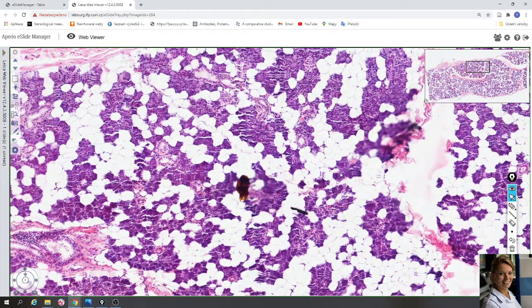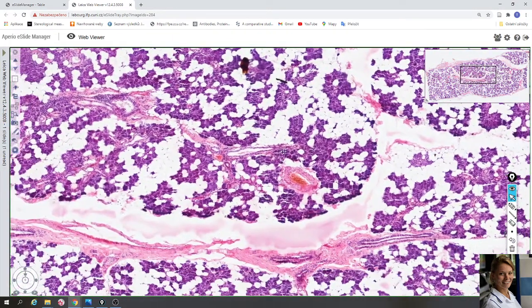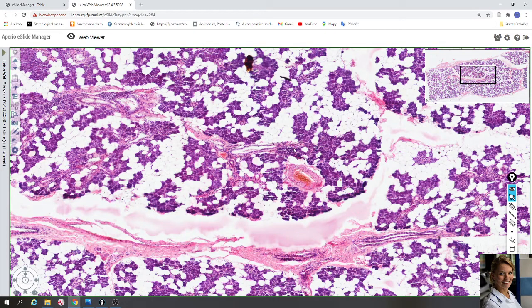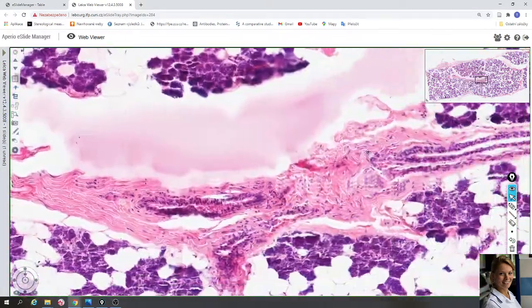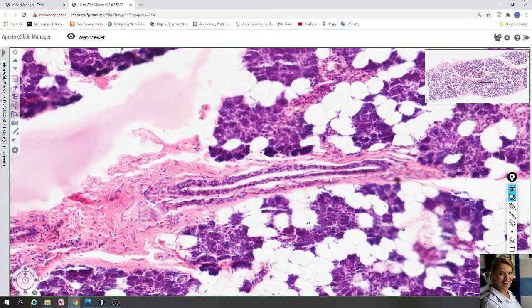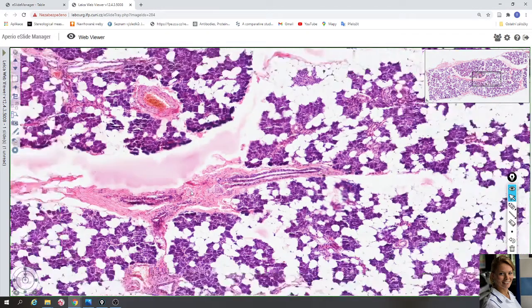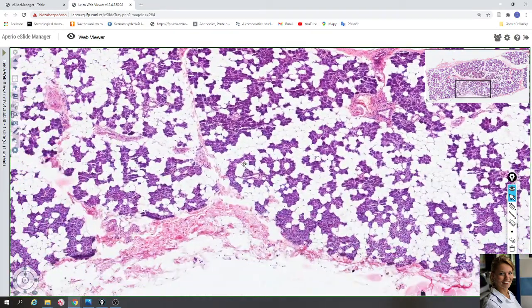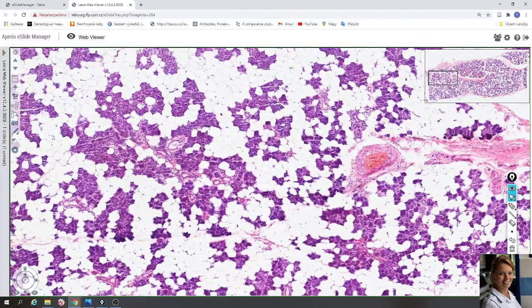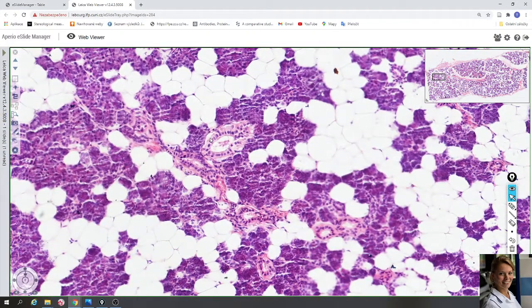This is a lobule with serous acini. Here in the connective tissue septa you can see a larger interlobal duct and a larger blood vessel. The interlobal duct is lined with two layers of cuboidal cells. The blood vessel is lined with endothelial cells. Here is also a striated duct with nuclei located in the center of the columnar cells.